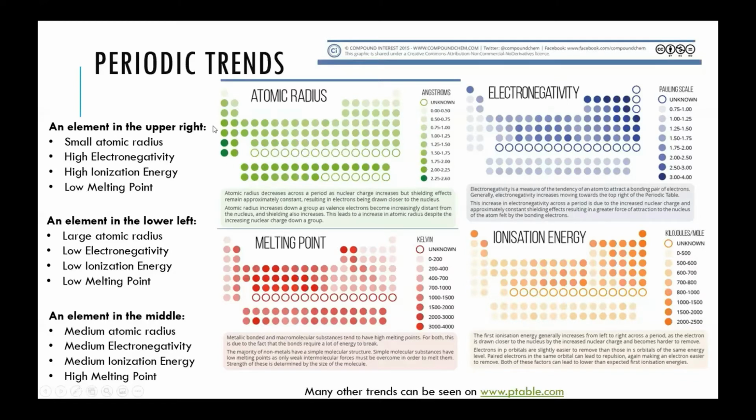As you move from left to right on the periodic table, do the metal ions become more soluble or less soluble? Do they become more reactive or less reactive? Also, as you're moving from top to bottom, do things become more soluble or less soluble, or more reactive or less reactive? And that's what this experiment is looking at, and that's what you're inferring from all of the different precipitation patterns.